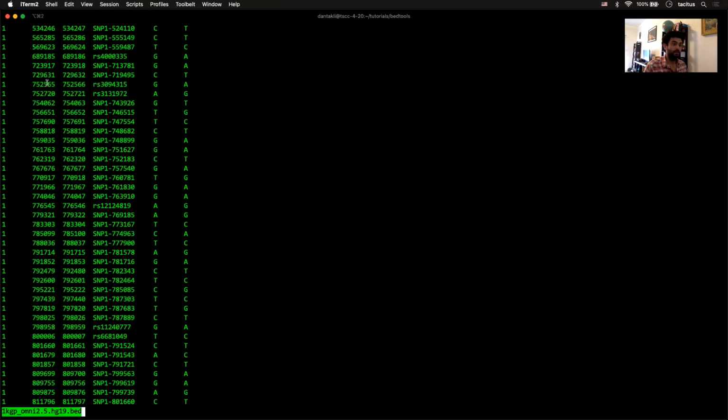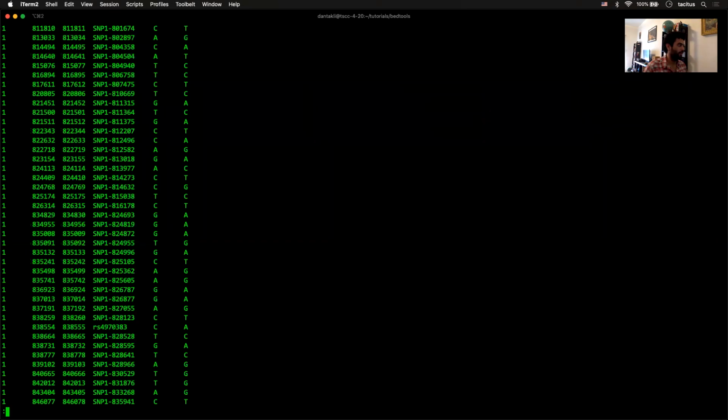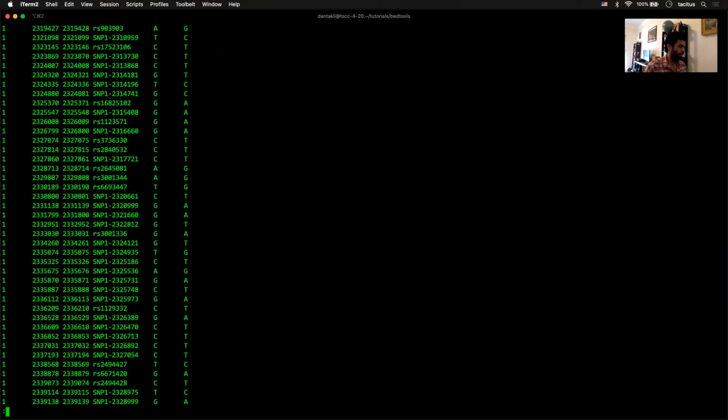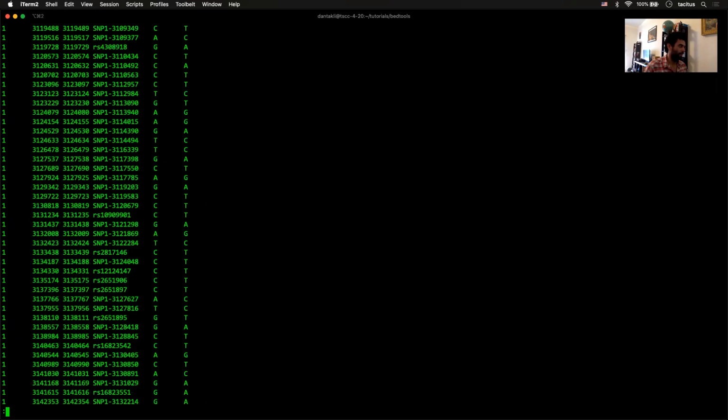So as you can see, it's like I said, chromosome, start, and SNP, reference, alt. And for a single nucleotide, you can tell that the numbers are not the same, right? But if you subtract the start from the end, you get 1, which is the length of a single nucleotide variant. There should be possibly some indels in here, because I think there are. But if not, they would be longer than 1.